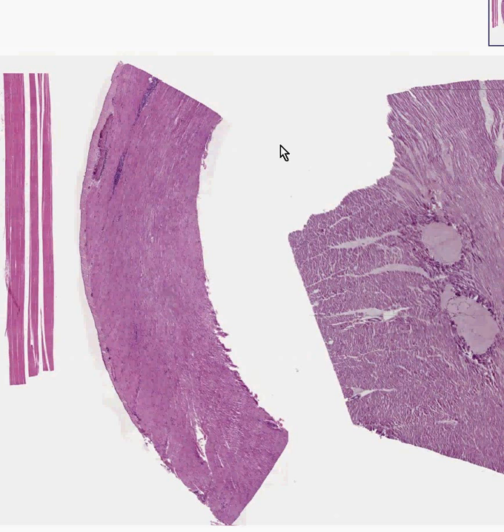This is going to be a terrific case. This is what I love, when you see a whole bunch of things and you use little algorithms to quickly identify what you're looking at. This movie is called Muscle.